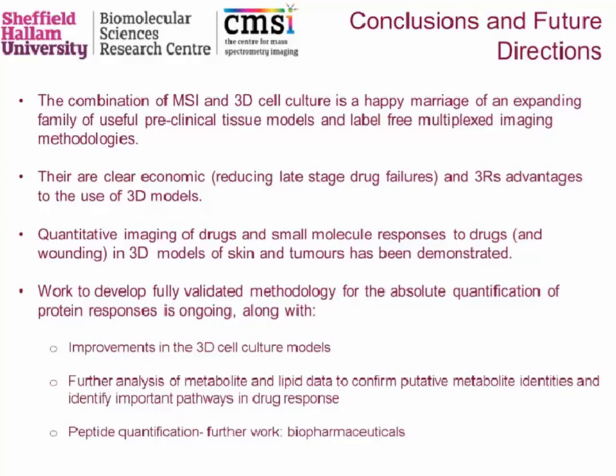I've demonstrated quantitative imaging of drugs and small molecules and shown that the mass spec imaging gives good data. And then we've started to look at whether we can extend this to absolute quantification of protein responses. These early data are quite promising, and this work is ongoing.